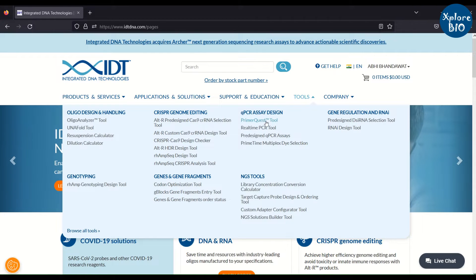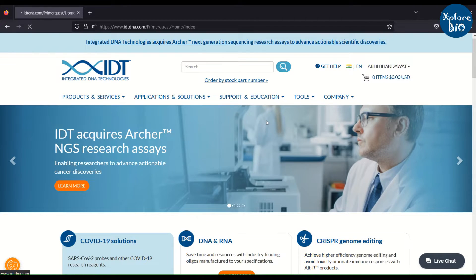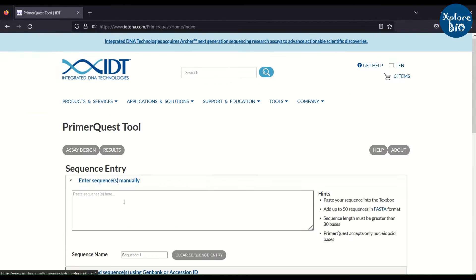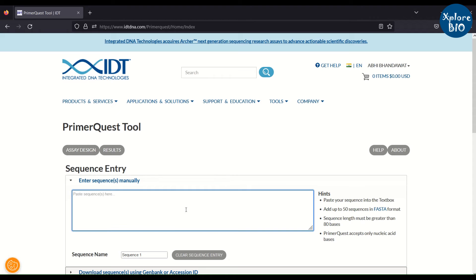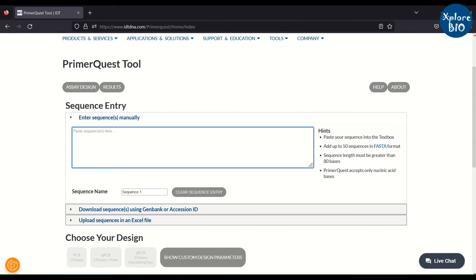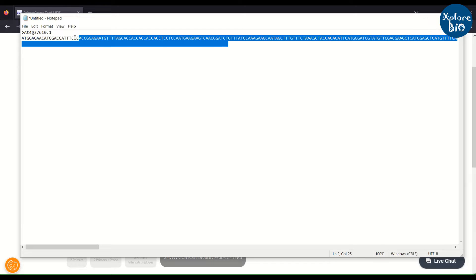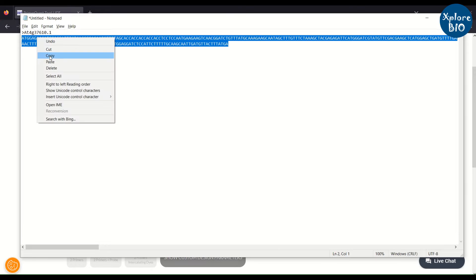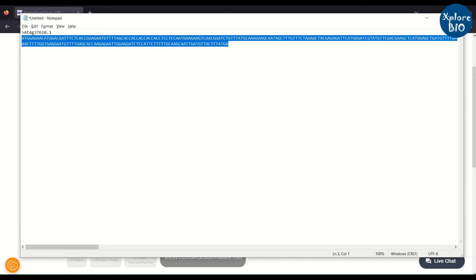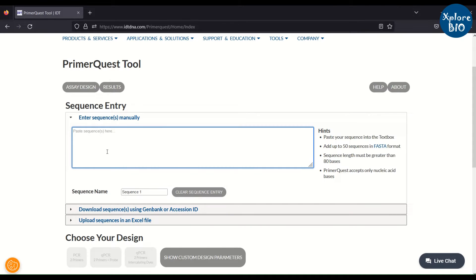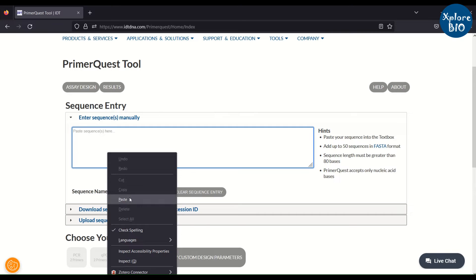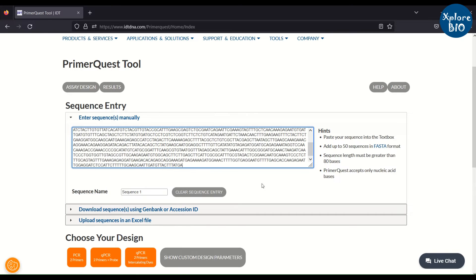For my own experiment, I use this tool. You need to create a free account to sign in and use it. You can insert one or more gene sequences for which qPCR primers need to be designed. Here I am copying one CDS sequence.